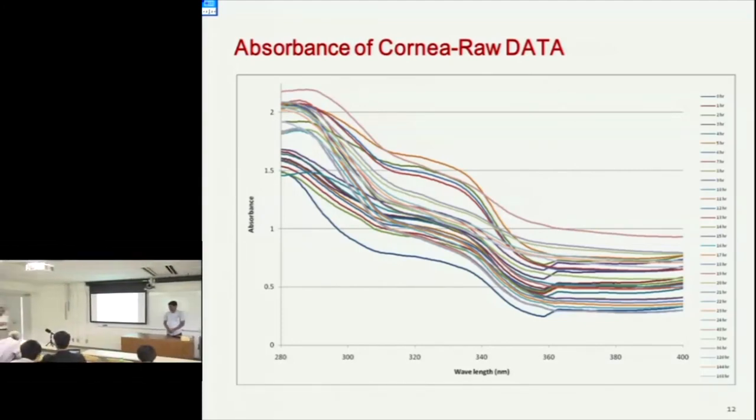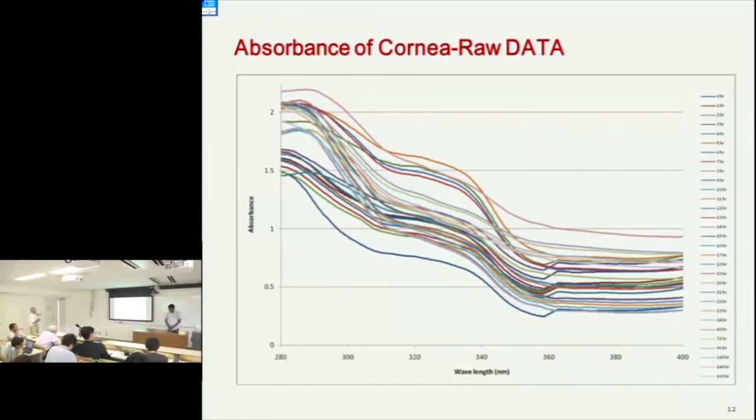Before, you mentioned several kinds of MAS. We may find a pure MAS, for example from a shop, and then measure its spectra. If you can find the pure one, your system should detect that kind of spectrum. If your system could detect this MAS and the peak is okay based on your reference, I will be fine.